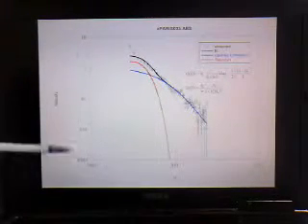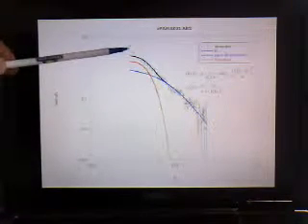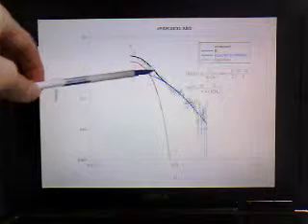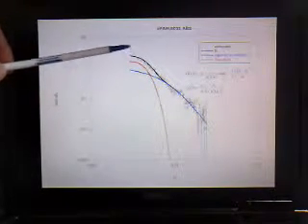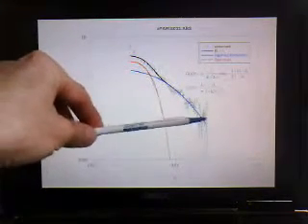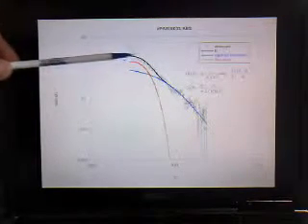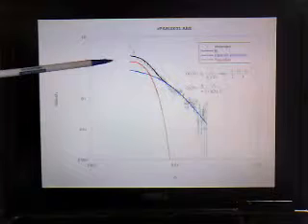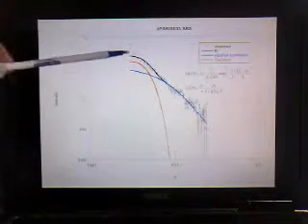So this is just an example of the data, again on a log-log scale. This is about 0.03 in Q, and this is what we called the bump in the previous YouTube video, and this is the bulge then here. So what you don't see is how these data decay as you approach Q, and then in some instances spike up. That's just not available in this detector setting.